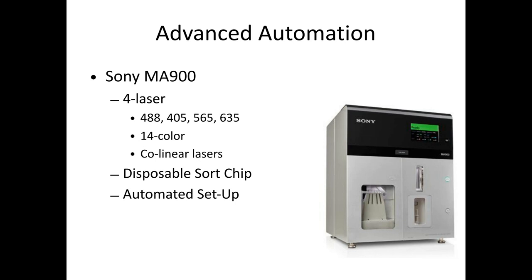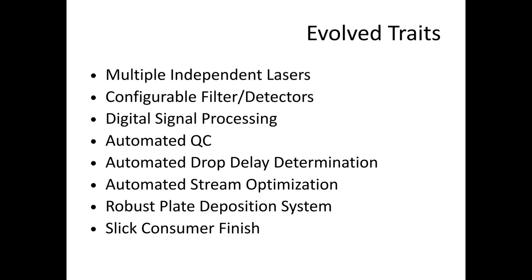So what I'm going to do next is go through those little traits I talked about and tell you what I think I've watched over that first decade and a half. I mean, having spatially separated independent lasers is a great thing. Having configurable filters and detectors was a cool thing too. That allowed us, with researchers who want to use novel dyes, to optimize the system for that. Digital signal processing, I mean, that's just the way it is. 20 years ago, we looked at that like, oh, this is some dark magic that I don't know what it is. And now it's totally the norm. So I know given enough time, the user base is capable of evolving to newer technologies.